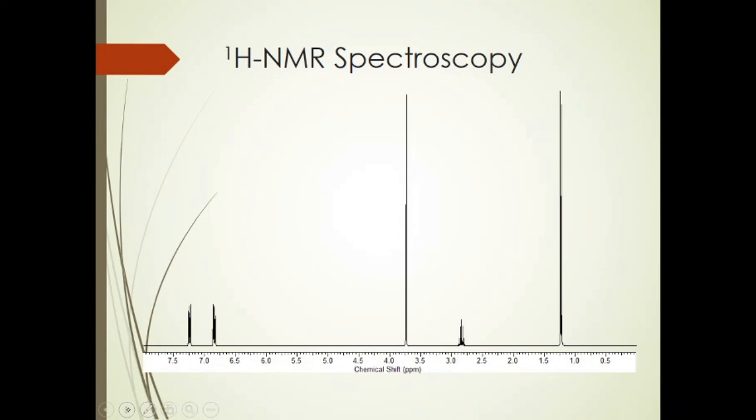So if we apply that here, our first peak is a singlet, which means there are 0 neighboring hydrogens, which of course we should have expected. If you remember, this was a CH3 from the integration. The chemical shift told us it was bonded to an oxygen, so there can be no neighbors.